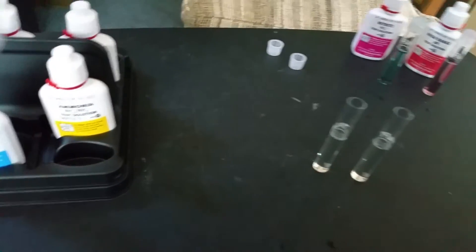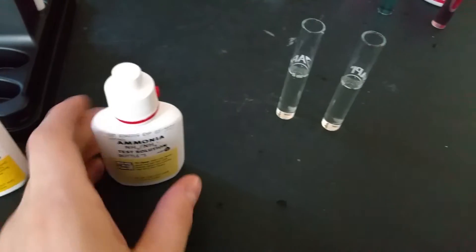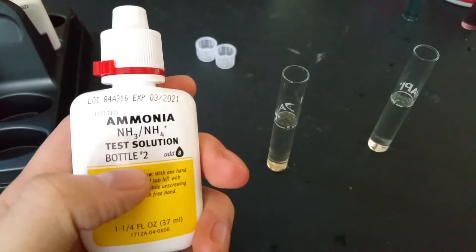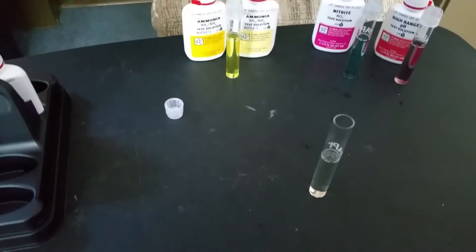Then we get the more fun ones — ammonia, which is actually a bit easier than nitrate. This one, just like nitrate, has 2 different bottles. Use bottle number 1 first, then bottle number 2. Each one takes 8 drops. Give bottle 1 a shake, add 8 drops, then add 8 drops of bottle 2 right after. Shake the test tube for at least 5 seconds, then set it with the others.